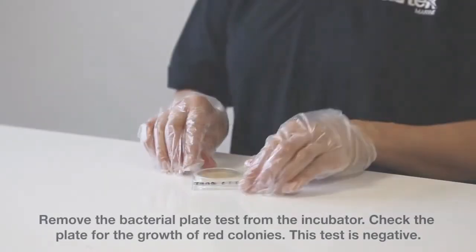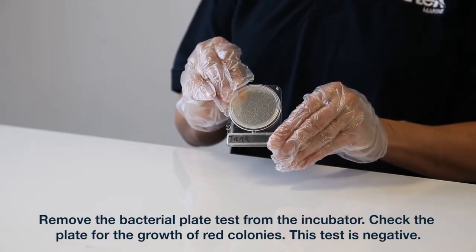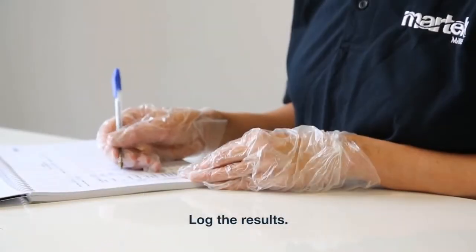48 hours later. Remove the bacterial plate test from the incubator. Check the plate for the growth of red colonies. This test is negative. This shows a positive growth of red colonies. Count the number of red spot colonies. Log the results.